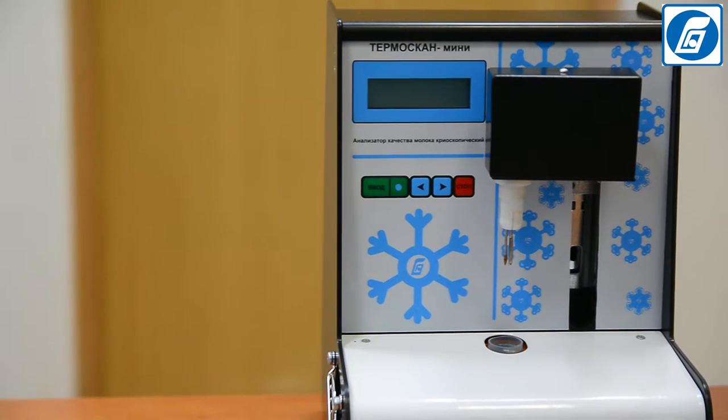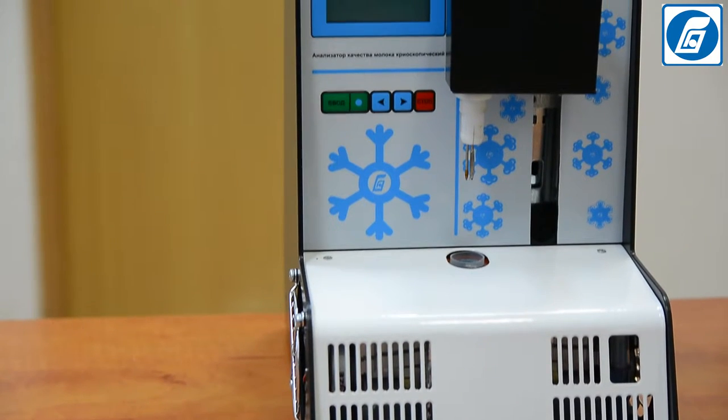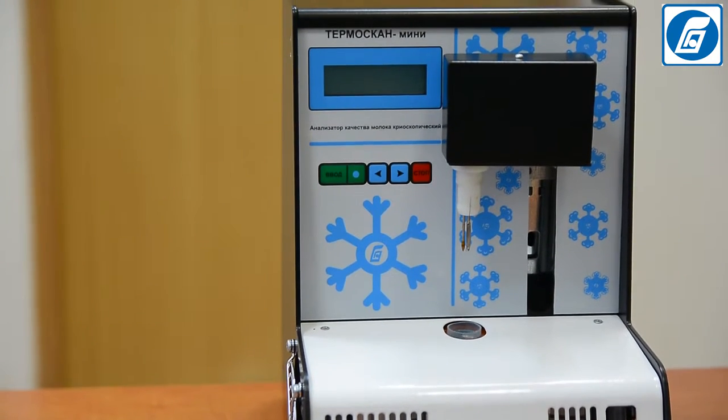We are glad to introduce the newest model among the cryoscopes available today, Thermoscan Mini, produced by Sibagra-Pribor.